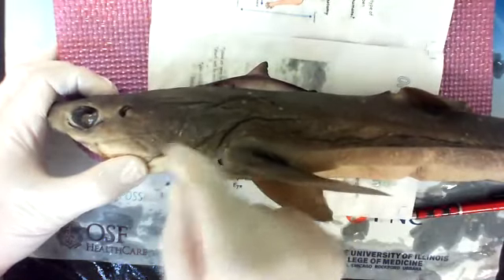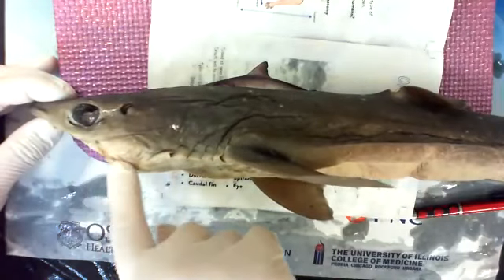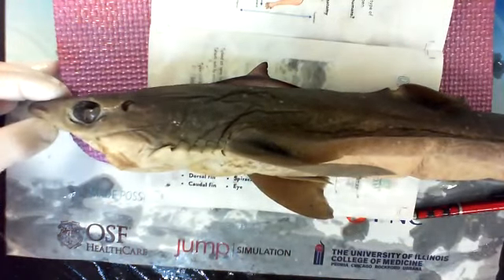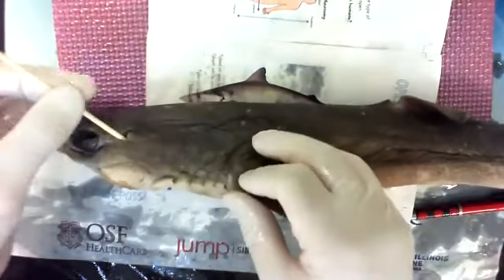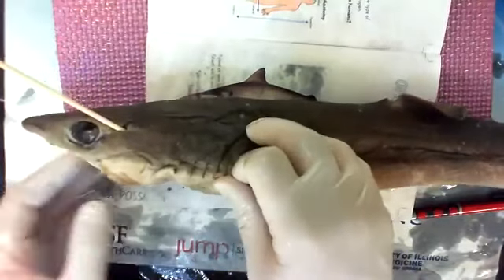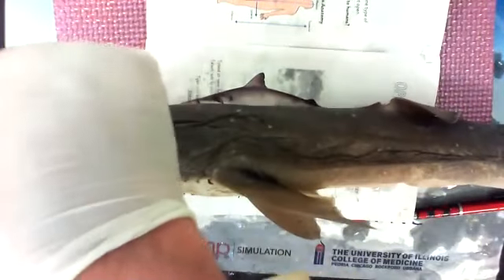Sharks don't have that. Sharks have to bring water either into the spiracle or through their mouth and out through the gill. So if you're curious, like I'm always curious, you can take your probe, take the dull side of the probe, and if you want, stick it in. Put my finger in. Ow, bit me. I'm kidding, didn't bite me. May have to try this later.